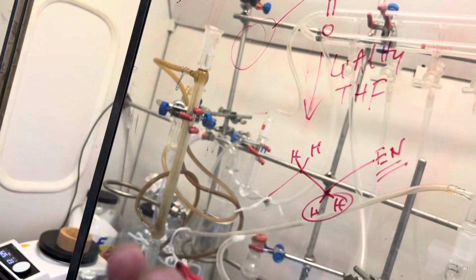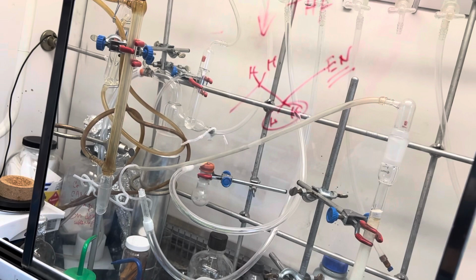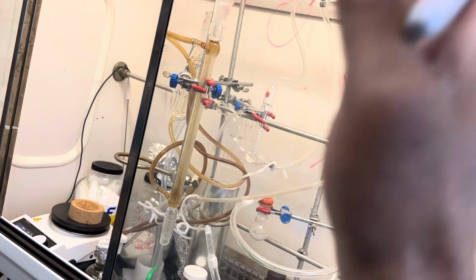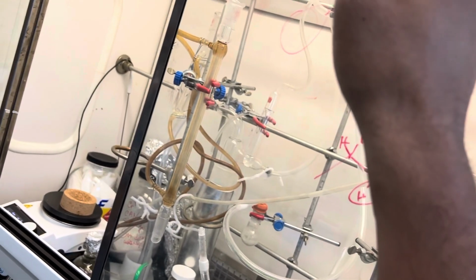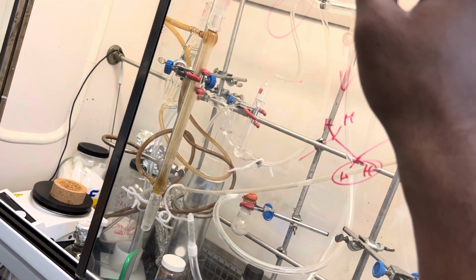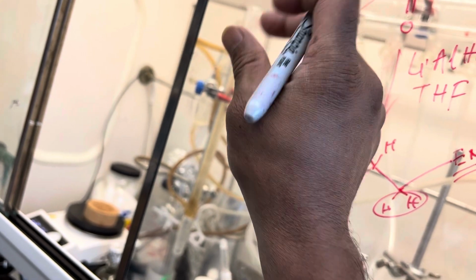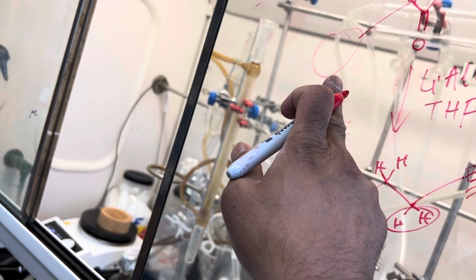But there is another question. If you did this reaction and some starting material is left, then in the carbon NMR you will still see those two peaks, right? But if you know the pure starting material, you can count how many aromatic carbons there are.